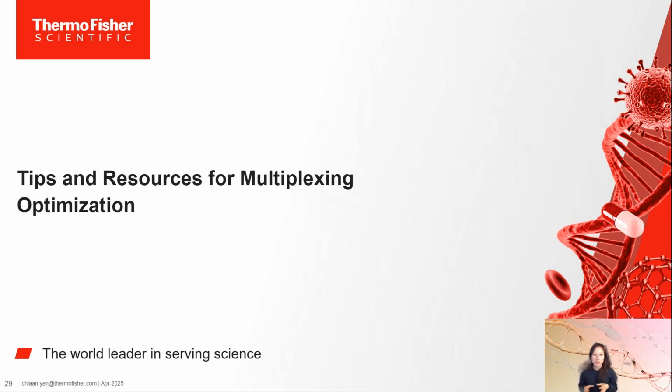And then finally, in the last bit of this webinar, I want to go over quick tips around optimization. I kind of talked a little bit about it in the assay design portion. I also mentioned it here and there throughout the presentation, but I want to wrap up this webinar by reminding you what are different things that you can change to optimize your multiplex workflow. And in the end, I will also provide resources that you can go back to in developing a multiplex qPCR workflow.